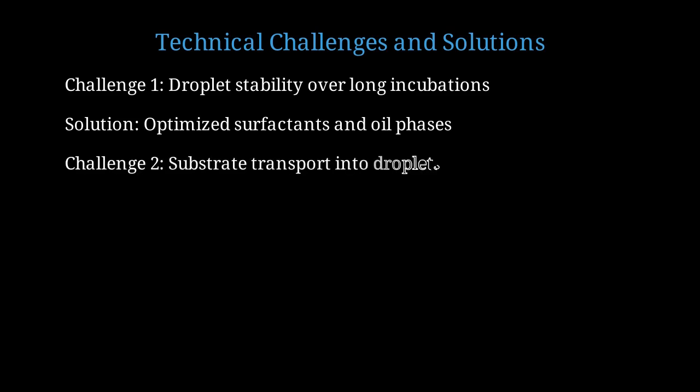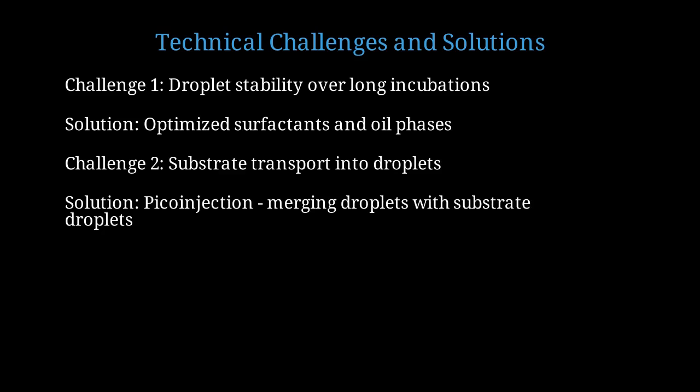Second challenge, getting substrates into droplets after formation. Sometimes we want to add a substrate after cells have grown in droplets. The solution is pico-injection. Droplets can be merged with smaller substrate-containing droplets using electric fields. This allows multi-step reactions in the same droplet.